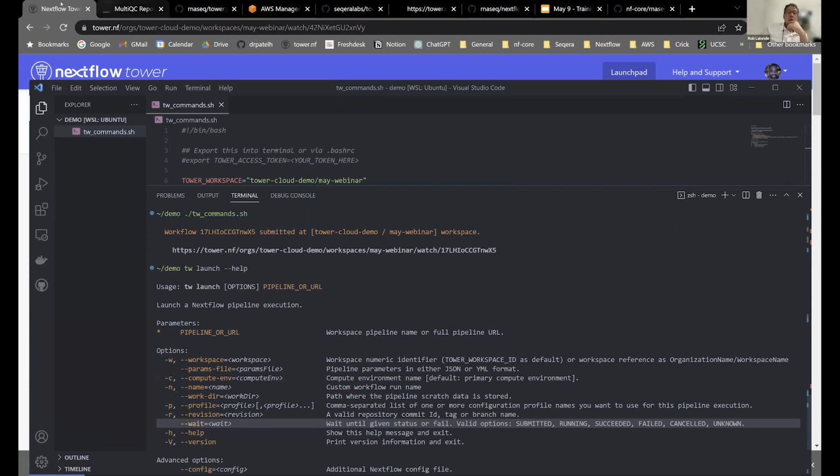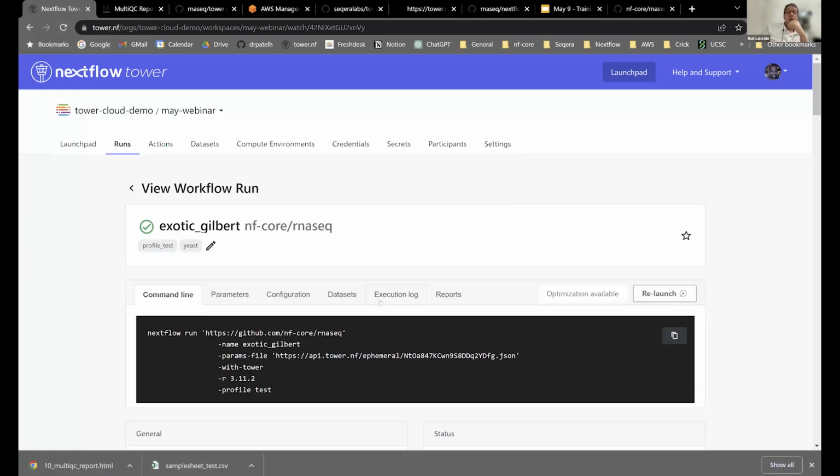Looks like you nailed that one. Saw a response from Camille. Is there dashboard support for work done in Nextflow Tower with NF Core pipelines? And does the dashboard have to fall into the NF Core dev side? Dashboard with metrics from different parts of the pipeline, like Bowtie to output, etc.